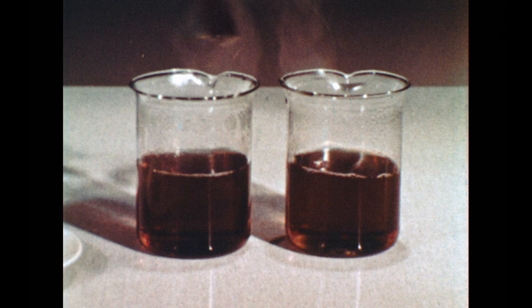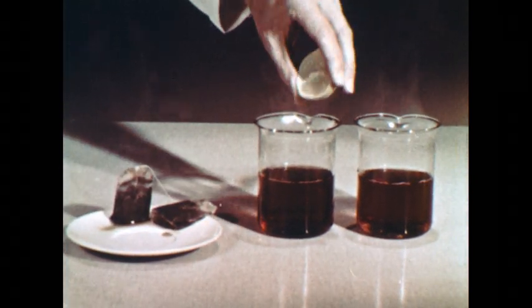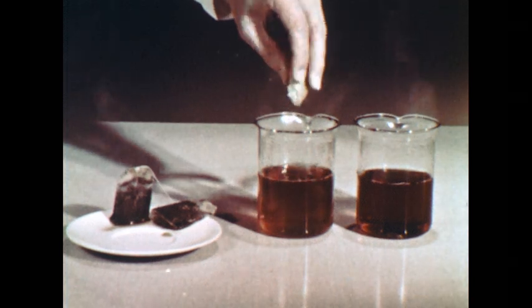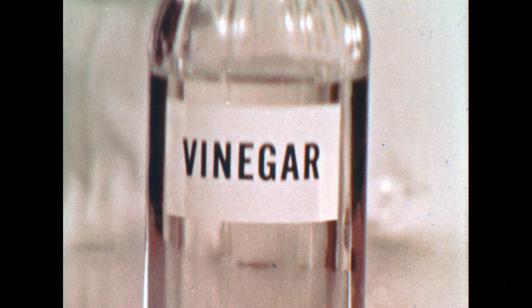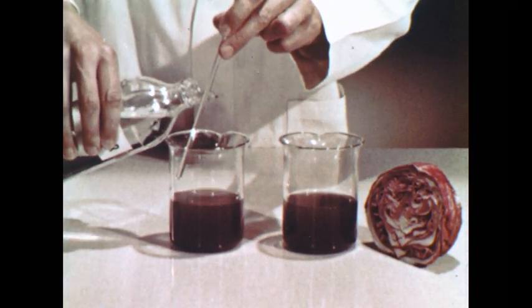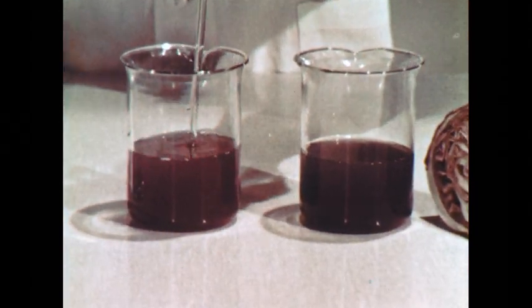Here are 2 beakers of ordinary tea. You may have observed, when lemon juice is added, a color change occurs. Likewise, vinegar affects red cabbage. Here is red cabbage juice plus vinegar.